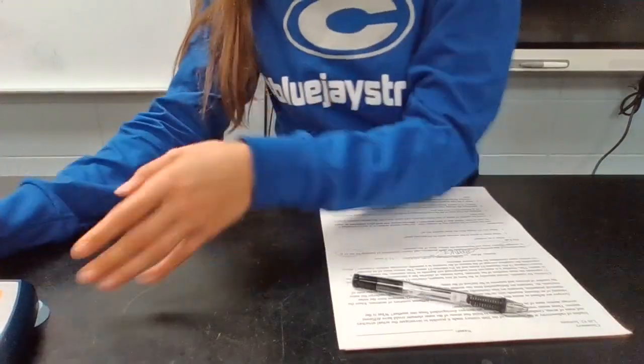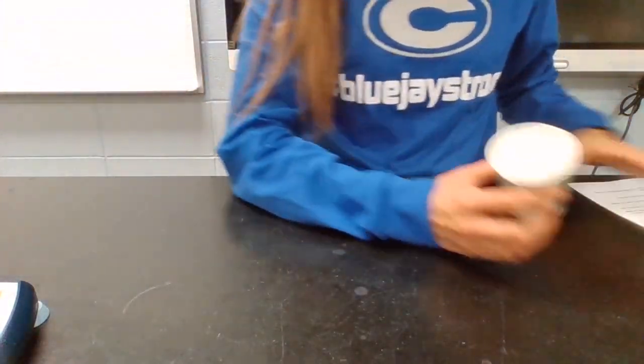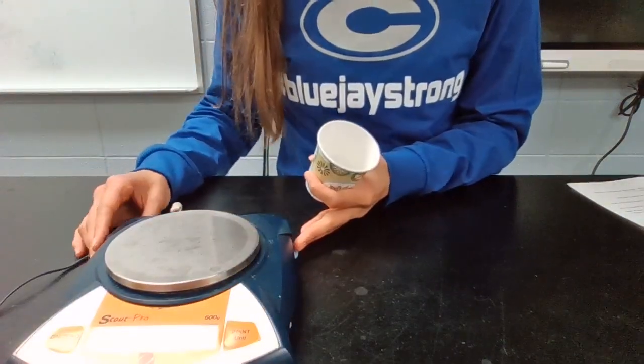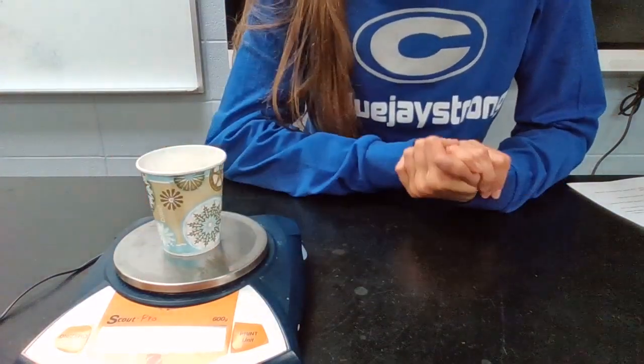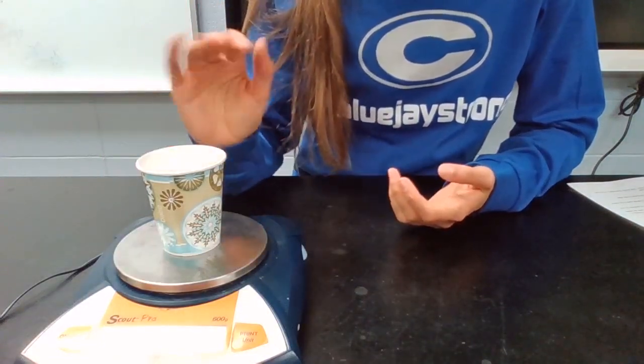So let's get into the procedure. I'm going to read the steps as I go, so if you want to follow along, you can. For my materials, before I even start, I have my lab printed out. I have an electronic balance here. I have a Dixie cup that I'm going to put on the balance to put my isotopes in. Otherwise, they will go everywhere.